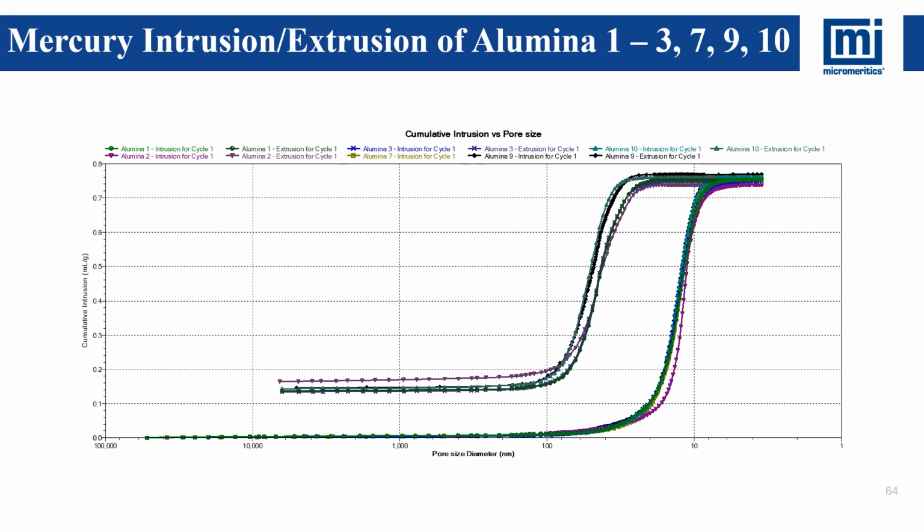And that pore opening size, or pore size, that corresponds to a pressure is one of the explanations for the hysteresis seen, the different path taken by the extrusion, where it is believed that it is related to cavity sizes, where we have small pore openings filling larger cavities behind them, kind of like the doorway into a room. That is one explanation for the hysteresis, and it's a fairly reasonable one, often used.